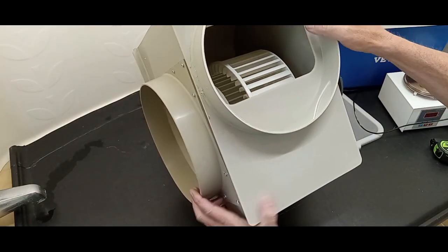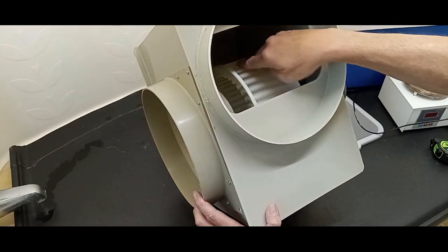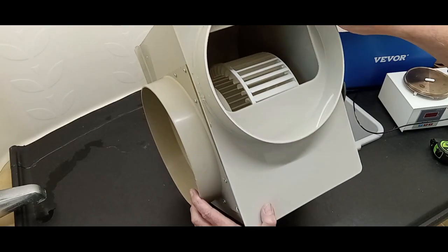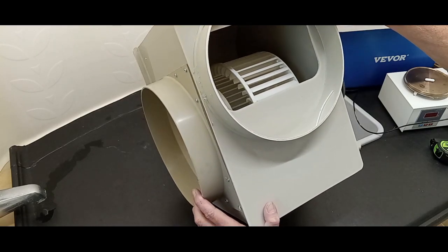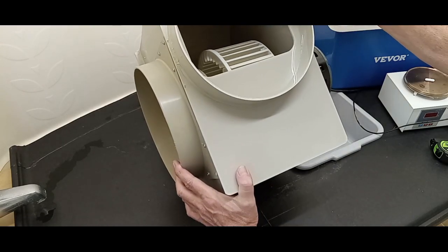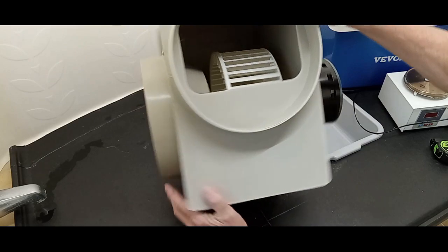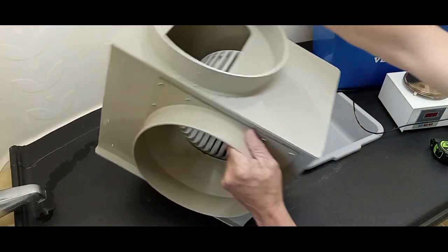What kind of caught me off guard with this at first look, because impression is everything, is the blower wheel only takes up roughly half the width of the enclosure, which struck me as a little odd.